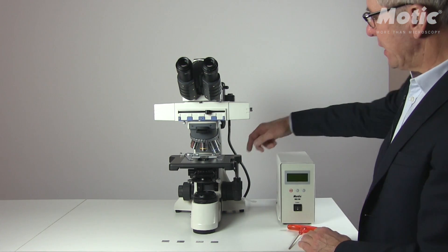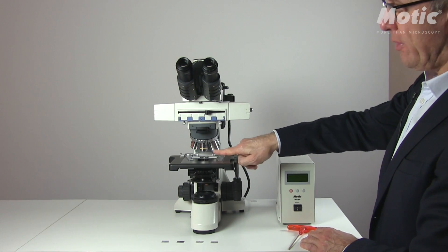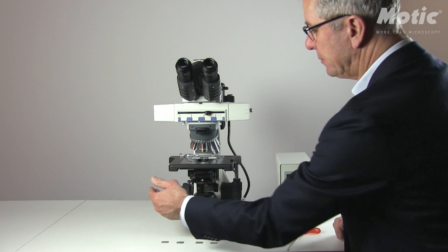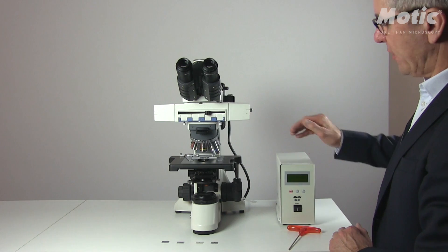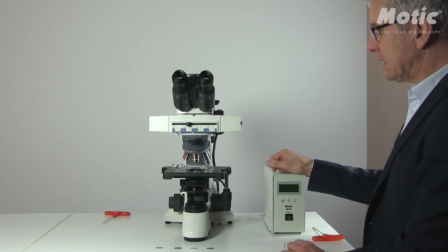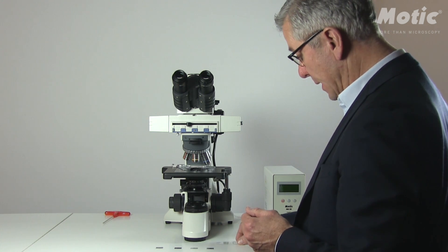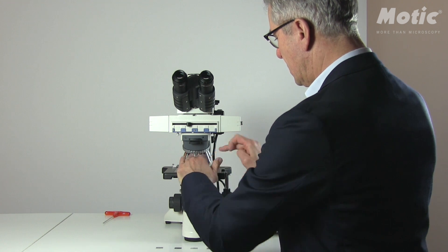Now all mounting is done: the fluorescence attachment, the pre-aligned lamp house, and the four filter cubes — two real filter combinations and two empty cubes to fill the slider. Now make a general setup of the bright field illumination. Switch on the microscope, place a sample on the stage, and do all procedures for a correct Köhler setup: field diaphragm, condenser height, and aperture diaphragm. Once done, switch off the microscope again.